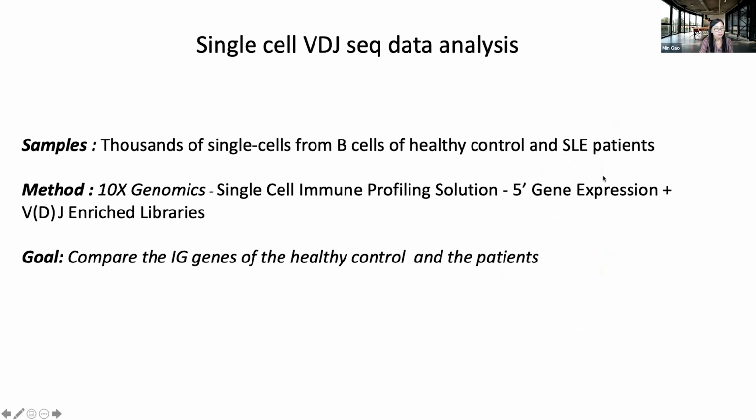And for the multimodal data analysis, one popularly used method is single cell VDJ-seq. Single cell VDJ-seq can be used to identify the VDJ gene usage, and you will know more information about both chains of the receptor. Both include the T cell receptor or B cell receptor.